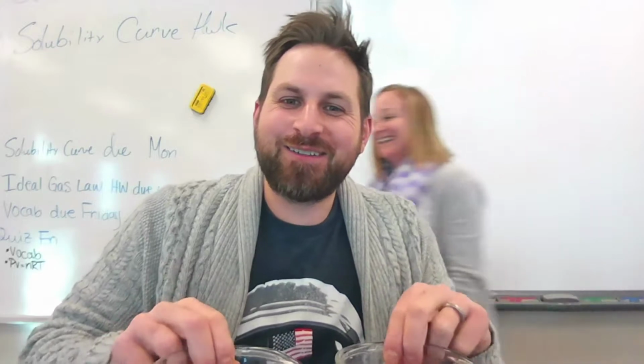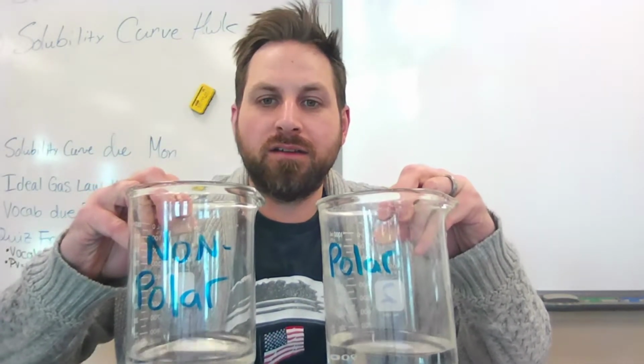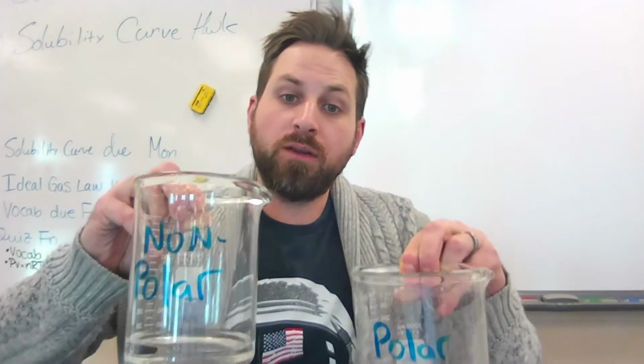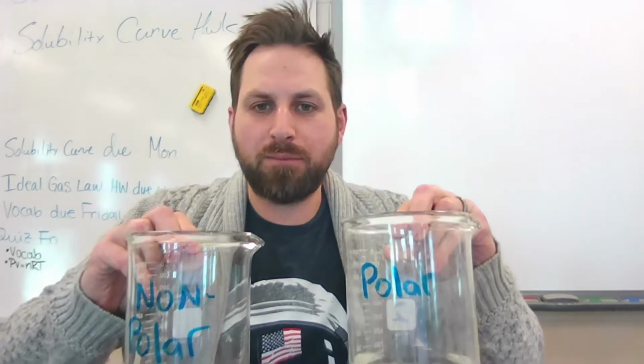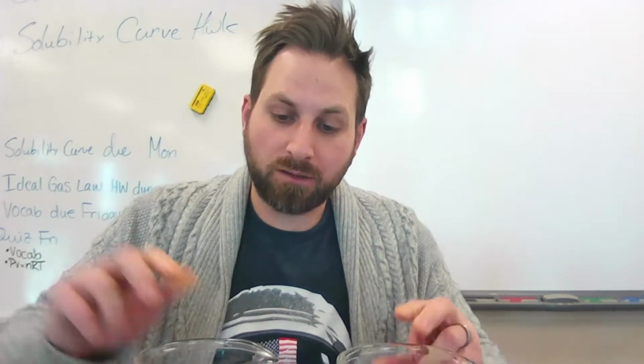Anyways, today we are going to learn about solubility. Earlier in the week, we revisited polar versus non-polar things. So I'm going to do a quick demo for you guys so you can see where we're going.